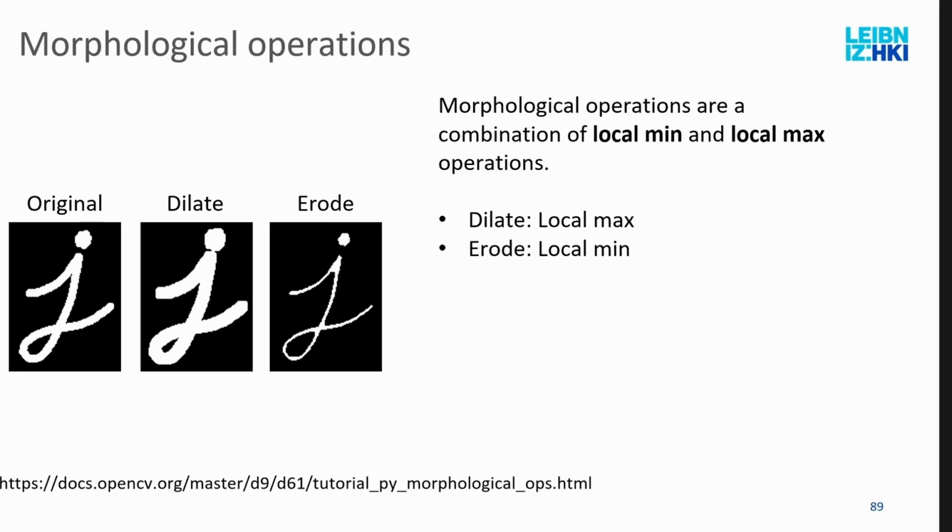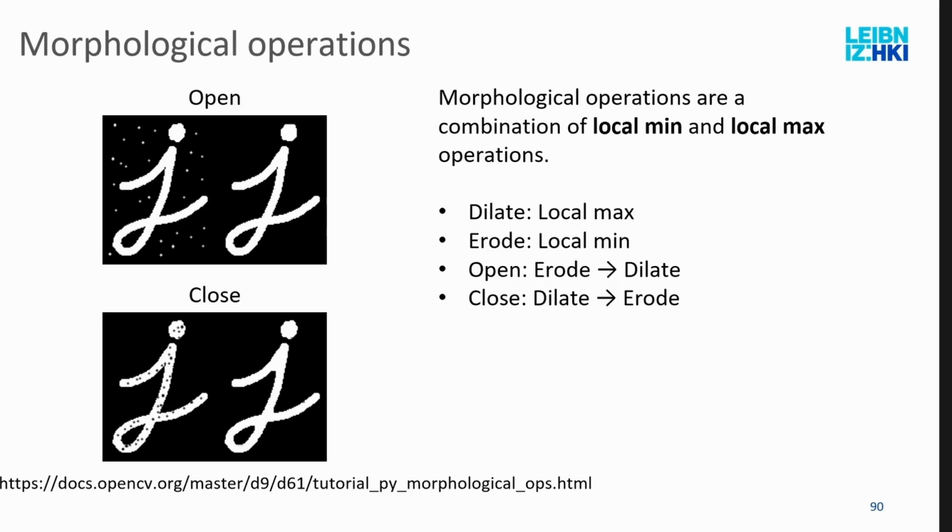These two basic operations, dilation and erosion, together with adding or subtracting images, form the basis of the morphological operations. Then you also find ones that are useful, for example, for getting rid of small objects that you don't want. The morphological opening operation would get rid of these little objects that were placed in there.